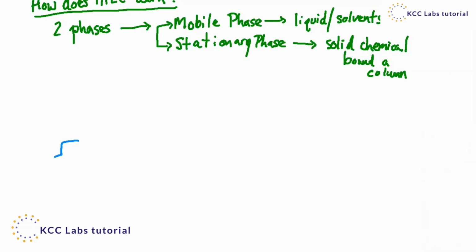So let's say it's called a solvent gradient. I want to start with 50% methanol, 50% water, and then I want to move to 75% methanol 5 minutes into the run for better separation at that point. You can tell or program your HPLC to pick and choose different amounts that it puts through the pump at a given time.